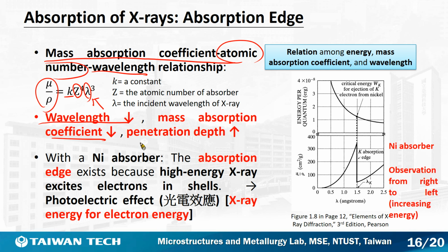So we have a higher penetrating depth. As we know, X-ray has a small wavelength, so X-ray is penetrating, different from light or other electromagnetic radiations. X-ray is penetrating.